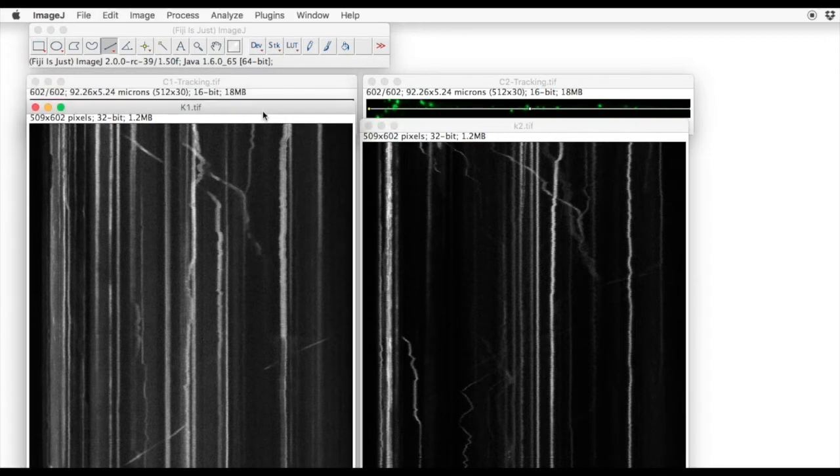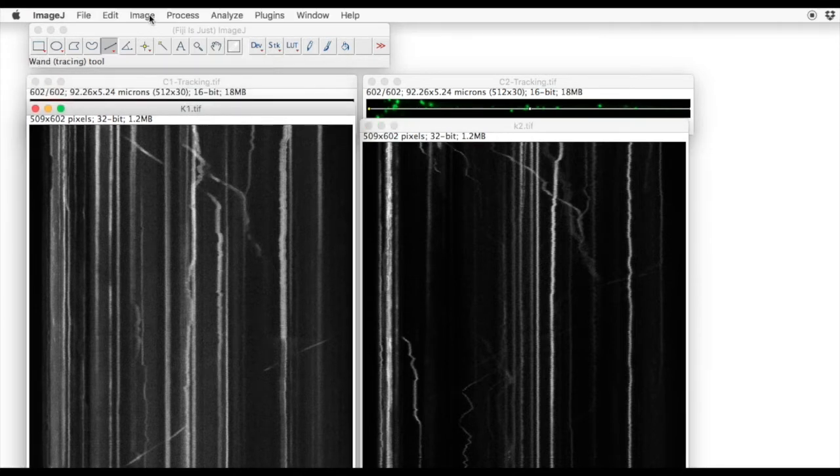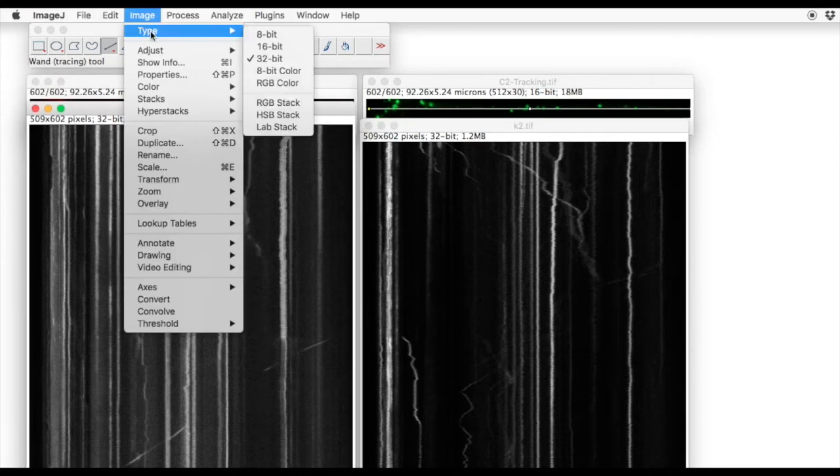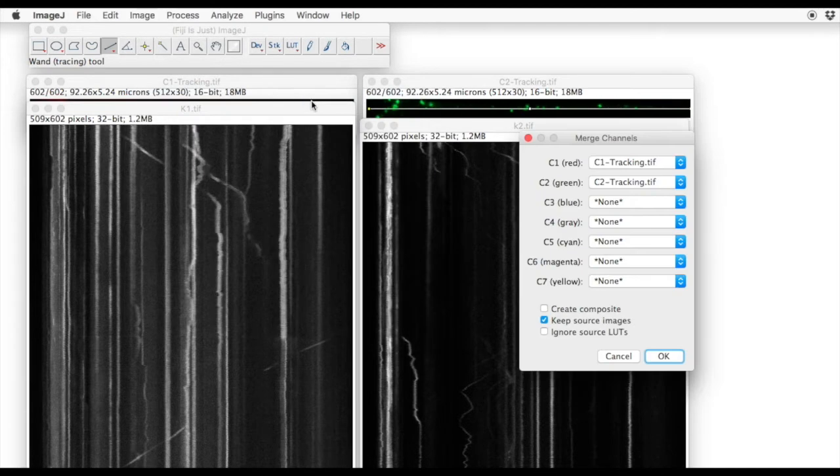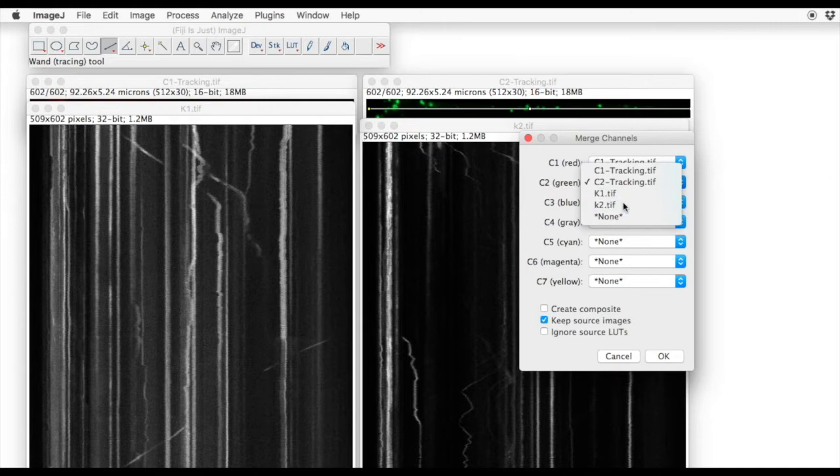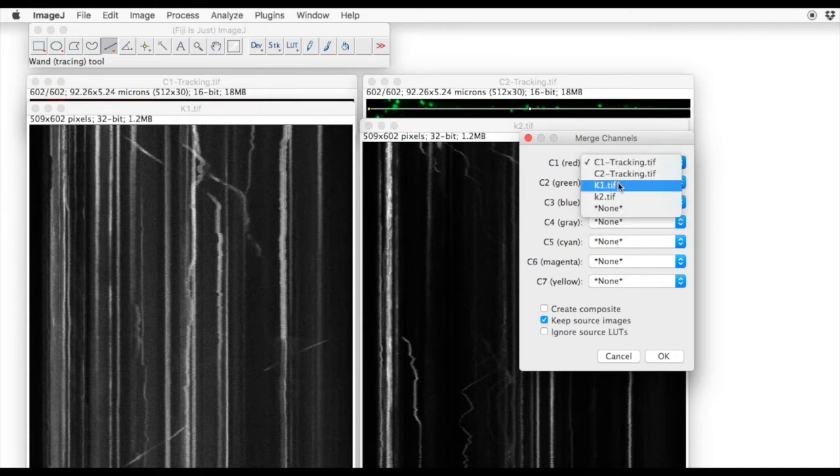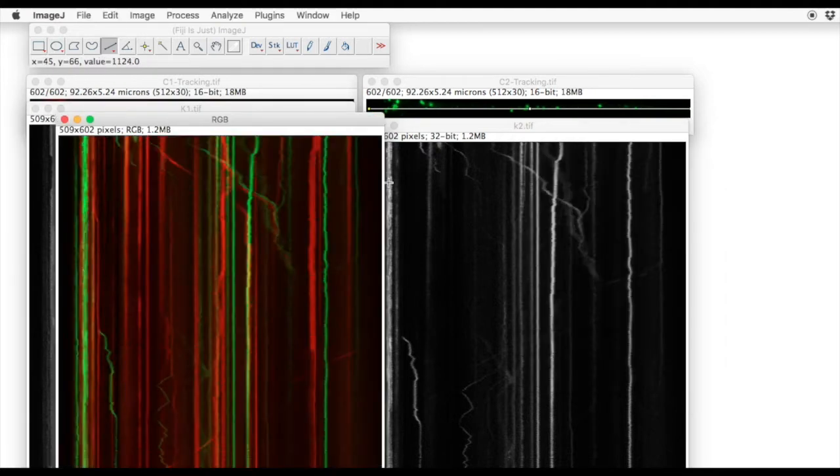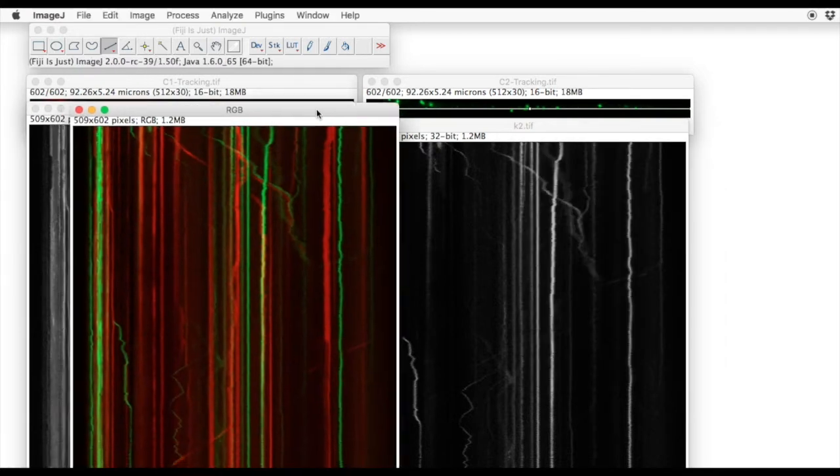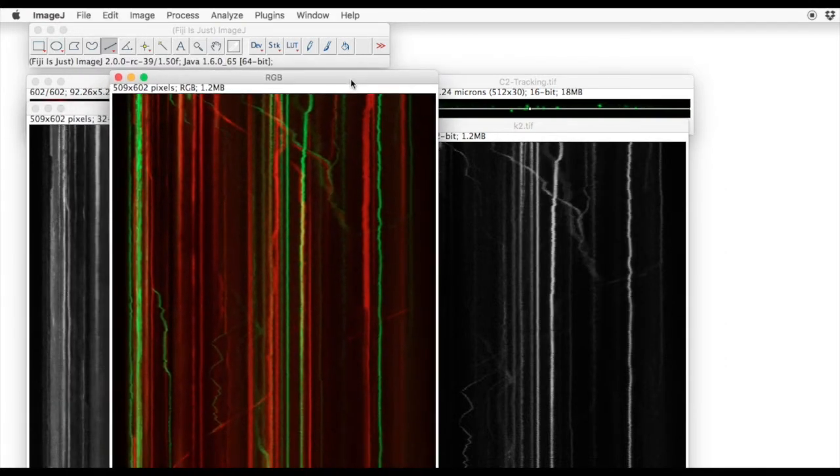So let's merge the green and red channels back. Image, Color, Merge Channels, and define the green channel as K2 and the red channel as K1. Keep the source images open.